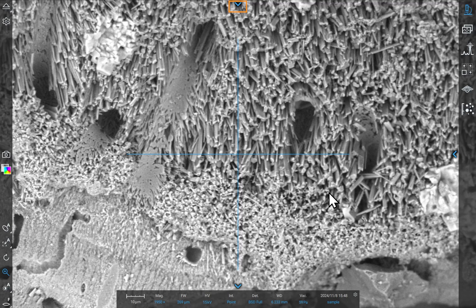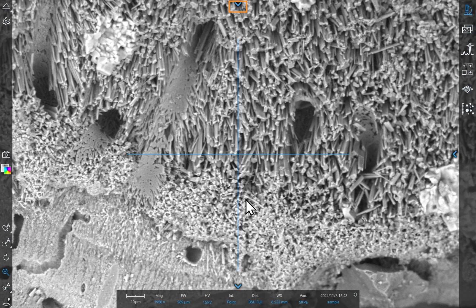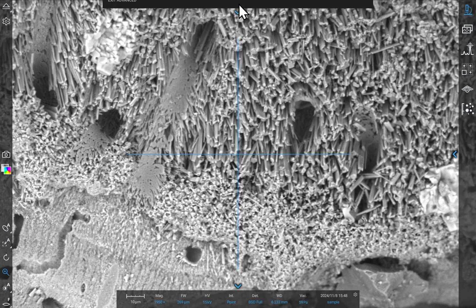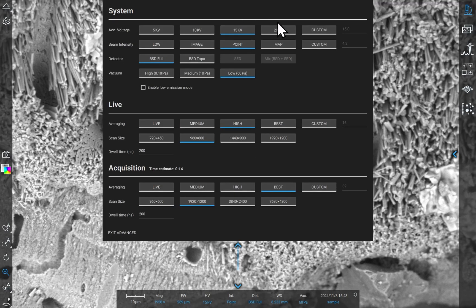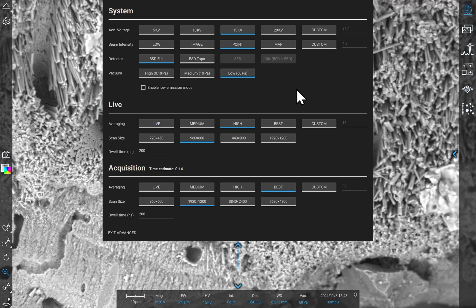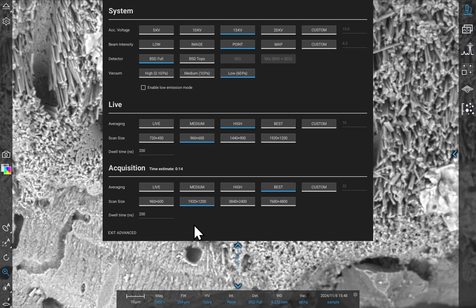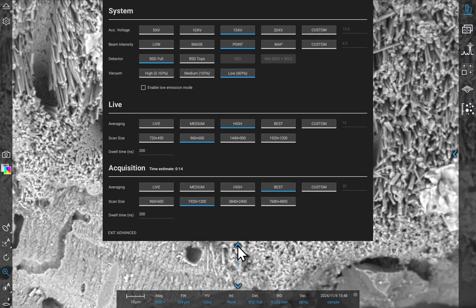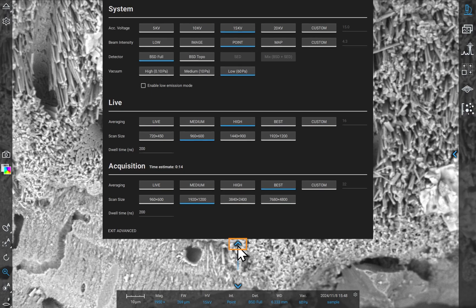When you're satisfied with the image clarity, click on the blue arrow at the top of the screen to open imaging settings. Here you have control over the scan size and frame averaging. For this demonstration, we're using 1920 by 1200 pixels and best averaging, which is equivalent to stacking 32 frames. Click the arrow again to close this menu.